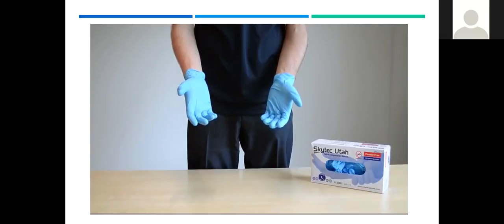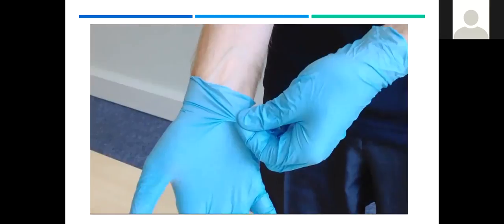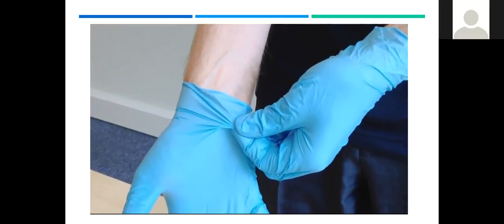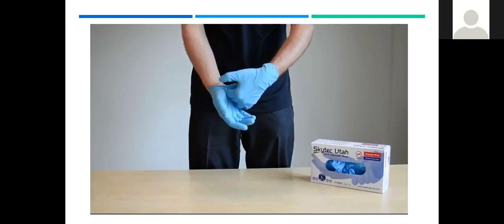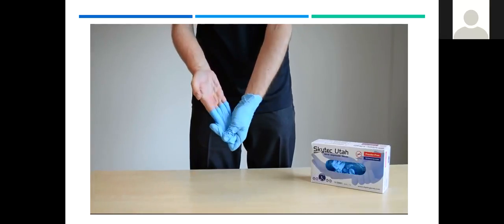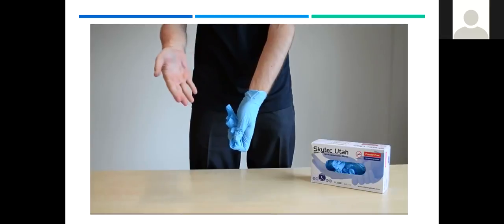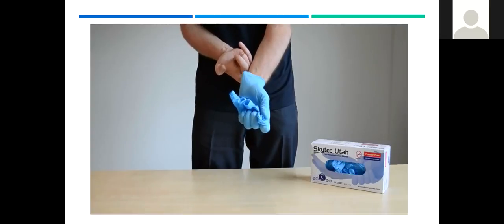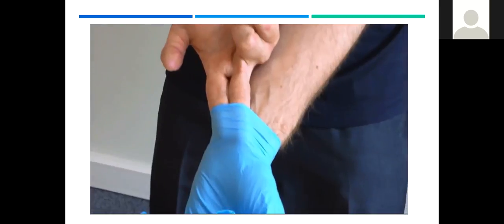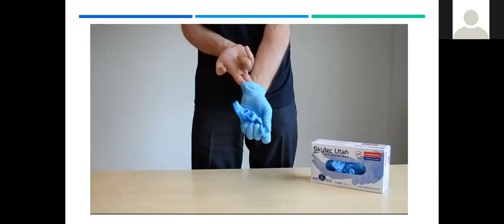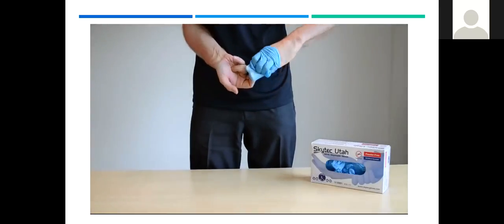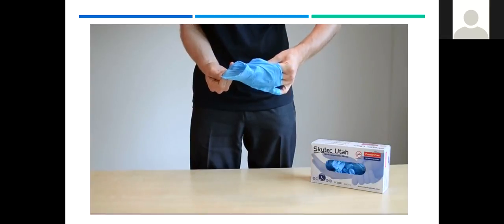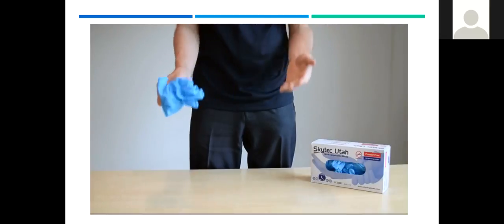When removing, first grasp the outer edge near the wrist area. Fold it over and peel it away from the hand, turning it inside out as it goes. This will trap potential contaminants inside the used glove. Once the glove is off, hold it with the gloved hand. To remove the other glove, place the bare fingers inside the cuff without touching the glove's exterior. Now peel it off from the inside, turning it inside out as it goes, and using it to envelop the other glove. Finally, discard them appropriately, and never wash or reuse disposable gloves.